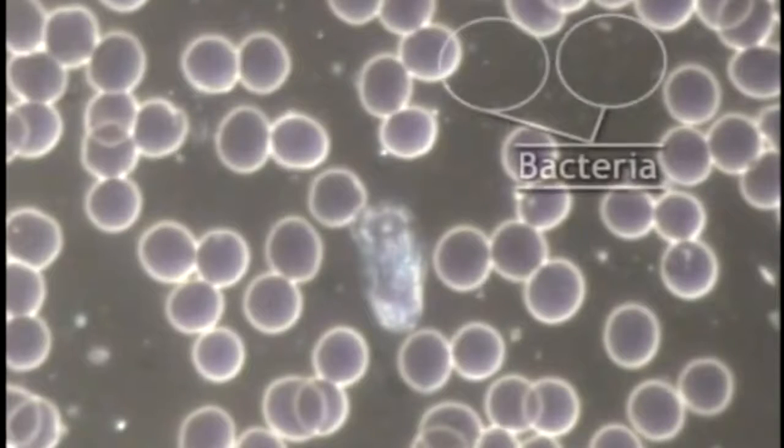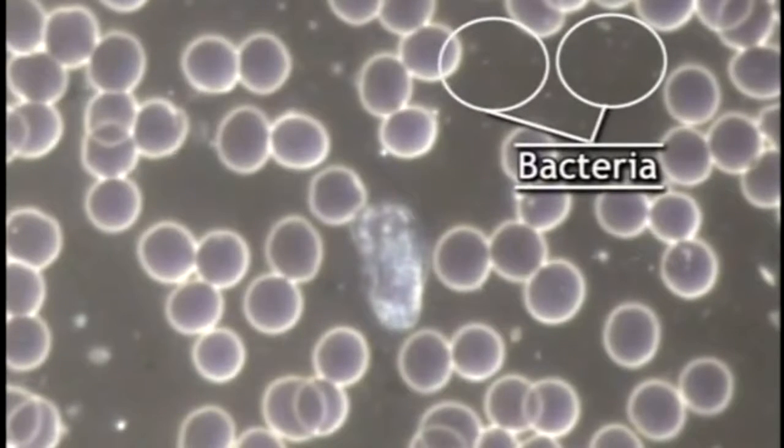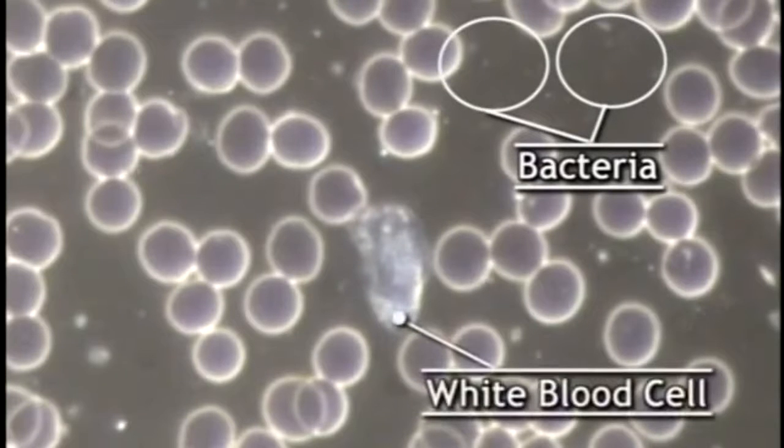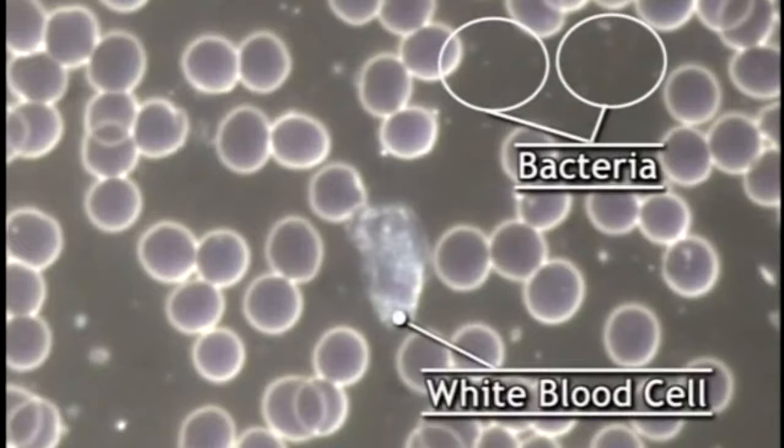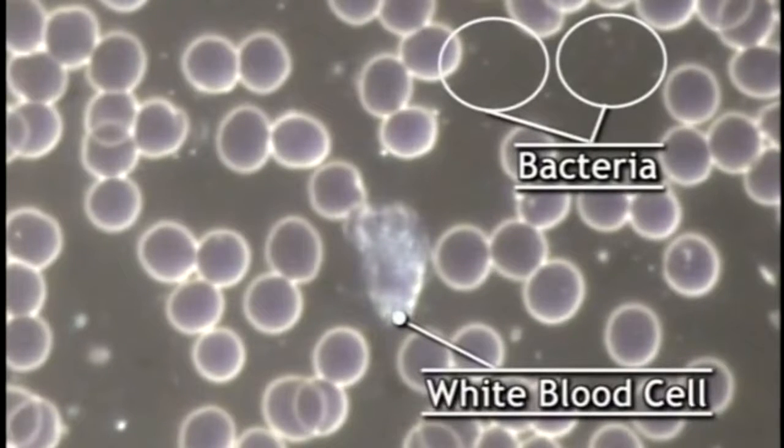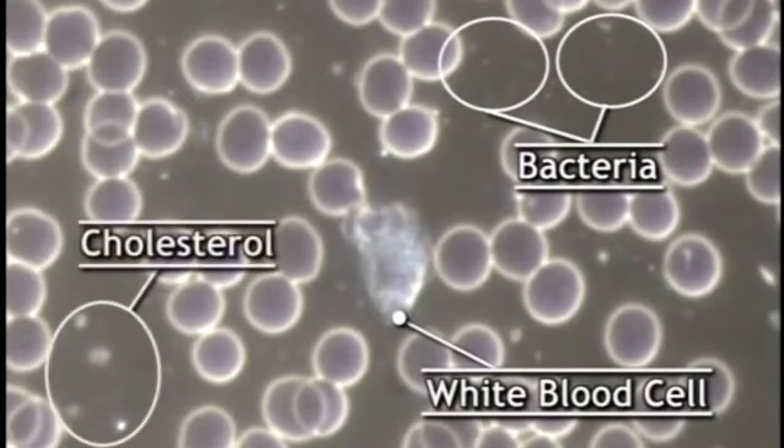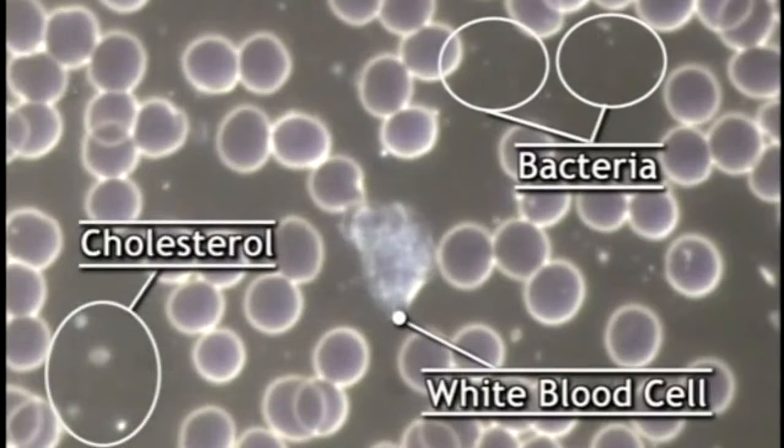The bacteria floating in the background, they're still there, but it's better. This is a white blood cell in the center. It's moving up and it's becoming wider. This white blood cell is starting to wake up. It's supposed to move across the blood, eat the bacteria, eat the cholesterol pieces, recognize what's supposed or not supposed to be there, and have a good time, of course.